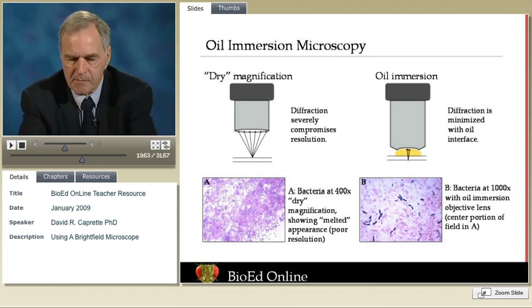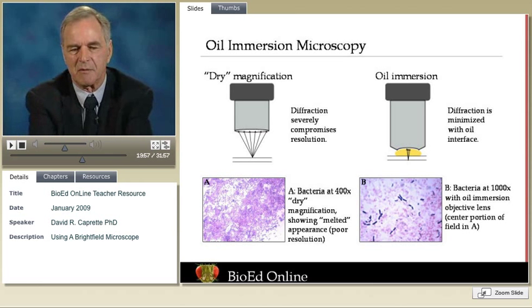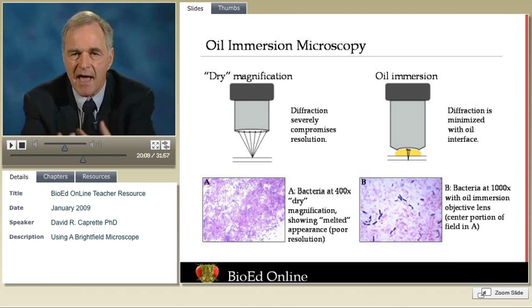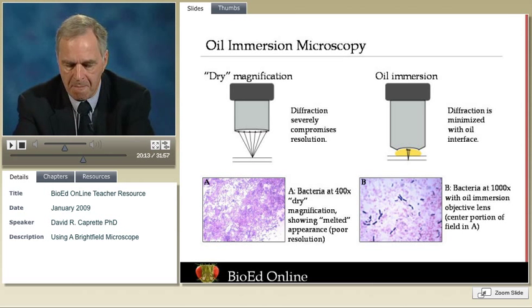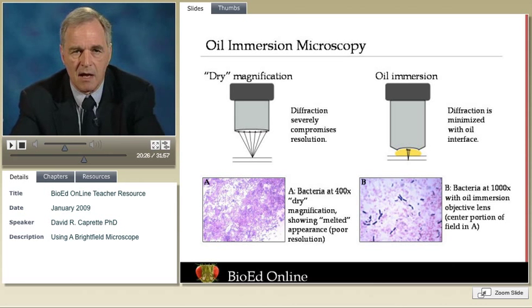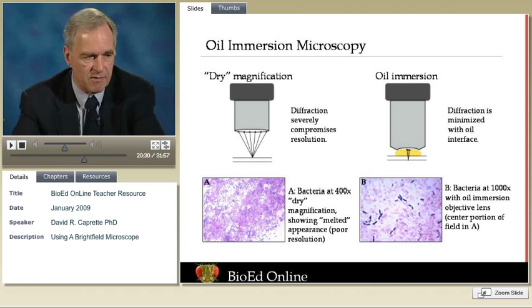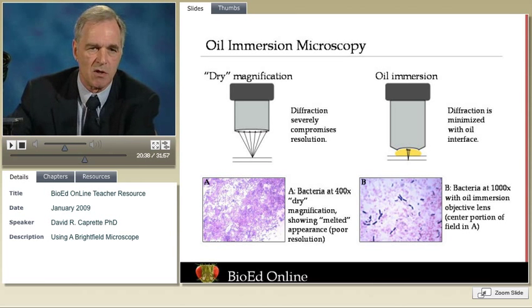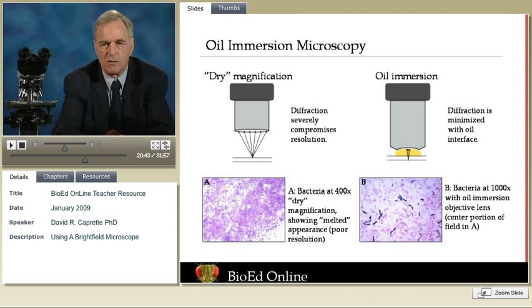Oil immersion microscopy is probably one of the trickiest techniques for students with a brightfield microscope. In microbiology — the study and observation of bacteria, assays and culture — one of the most important techniques is the Gram stain, where we stain a bacterial smear, heat-kill the bacteria, and then visualize them. Bacteria by themselves have very little ability to produce contrast; they're too small even if they do have color. At 400 power, bacteria — which might be a few micrometers long and a half a micrometer in diameter — can't be seen with sufficient resolution to distinguish individual cells. In many cases, they look like they're melted onto the slide.